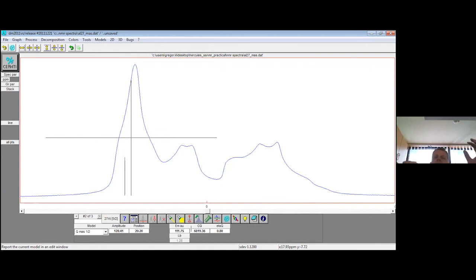So in a 2D plot you get a cross peak for a given carbon and a given proton, and you say, okay, this proton signal belongs to this carbon, so it is attached to this carbon. The other proton signal is attached to another carbon, and so on. So these are all the ways you use to further explore your material.